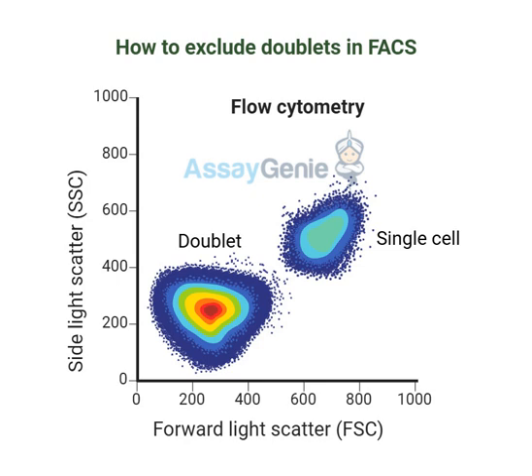Well, one thing that has a lot of potential is the use of artificial intelligence and machine learning. AI for cell analysis. Yeah. Imagine having software that could automatically identify and get rid of those doublets even better than we can do now. Wow, that would be amazing. Like having a superpowered assistant. Exactly. It would not only save researchers a ton of time, but also really reduce the possibility of human error. So it's like taking the human element out of the equation, making the whole process faster, more efficient, and even more accurate. Precisely. And that's not all.